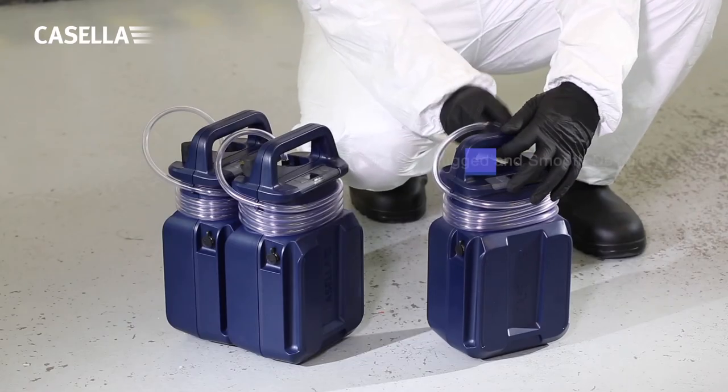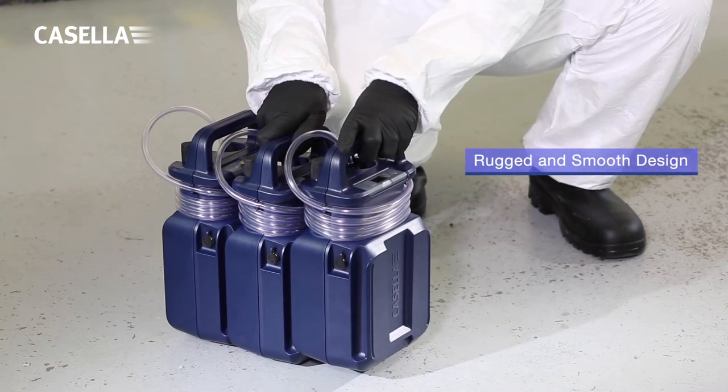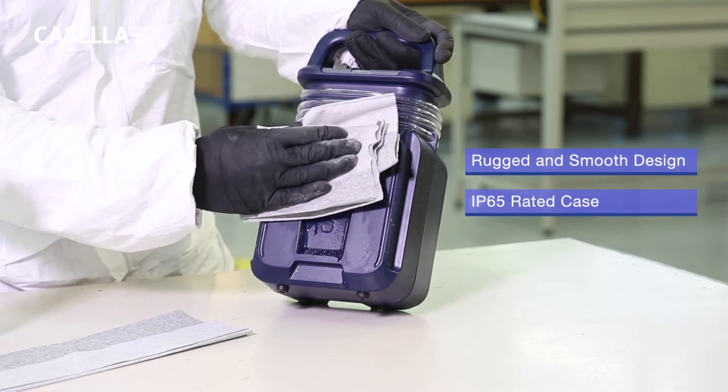The Vortex 3 has an extremely ergonomic design that is lightweight and rugged. Its ABS casing is also very easy to clean between sampling tasks.